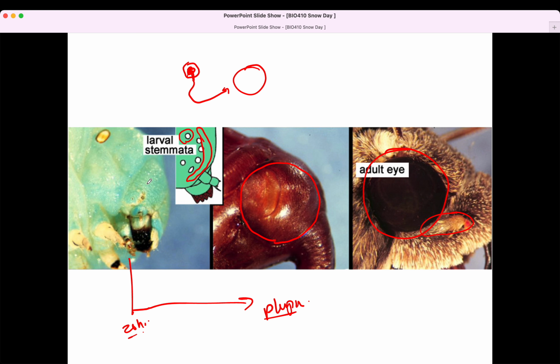Remember, the body of a caterpillar is kind of hollow, like our chest cavity, and not solid. And so for the dissection here, we actually can just cut a piece of tissue out that's pretty much the same as this, just a little patch of tissue. And this head is called a head capsule. It's a really hard exoskeleton or cuticle. And we just cut that out carefully and stain that and look at it under a microscope by looking at the inside.